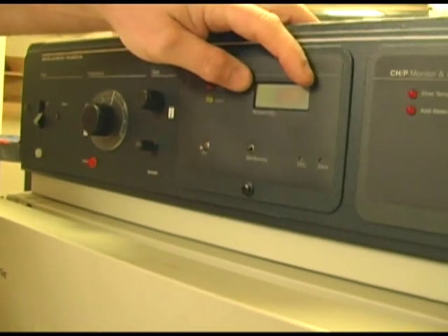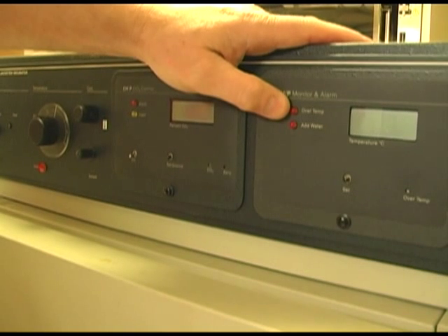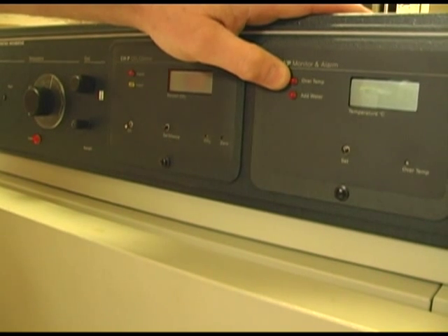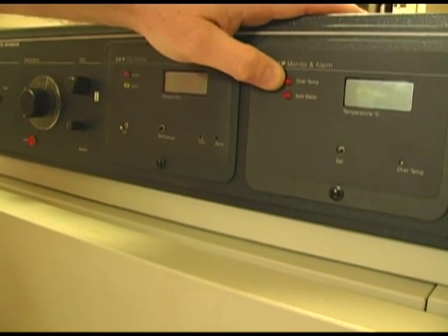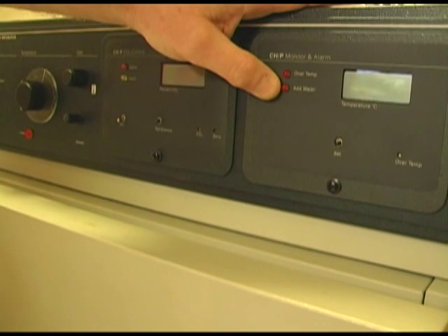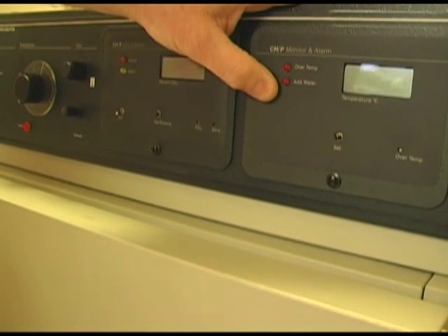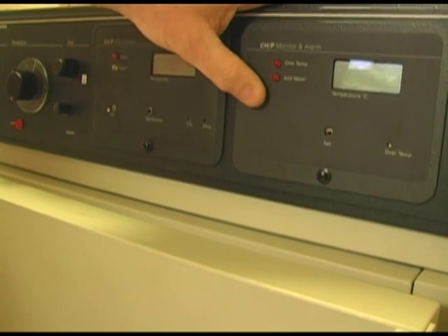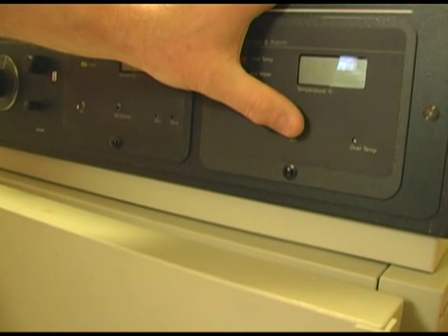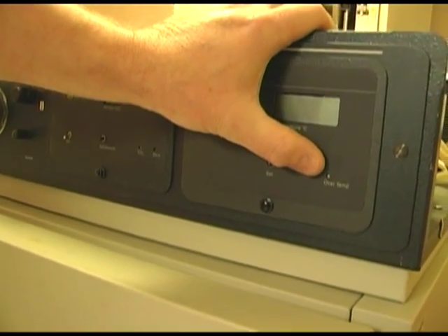You have your display. Moving on to the right, we have a monitor and alarm section. The first LED is for over-temp — the over-temp set point is 38 degrees, and if the incubator goes over 38 it will alarm. Below that you have an LED that says 'add water'; if you run low on water that light will come on, telling you to add water. This is common to most water jacket incubators. You push this button and, using the screwdriver, adjust your over-temp value.